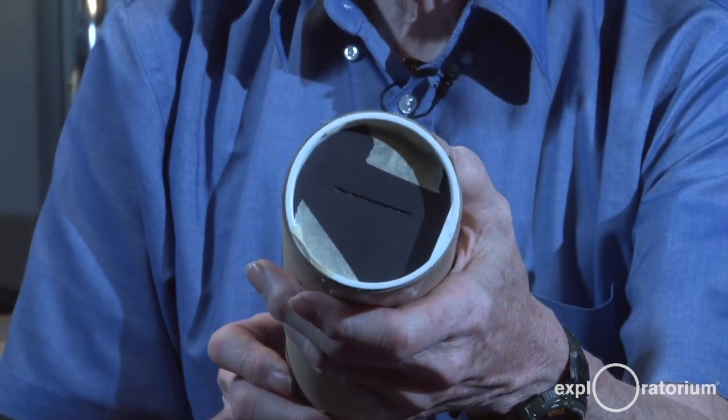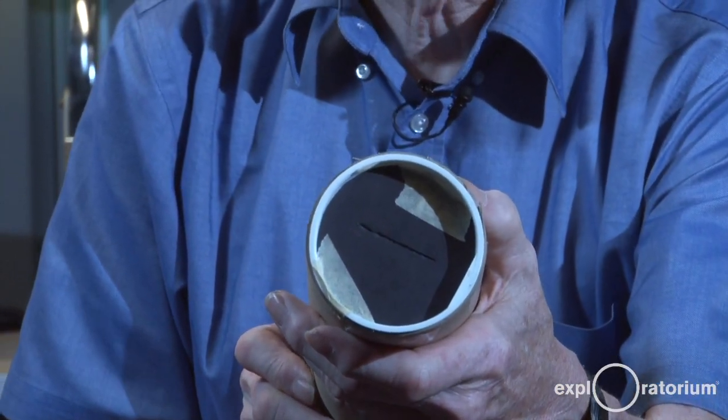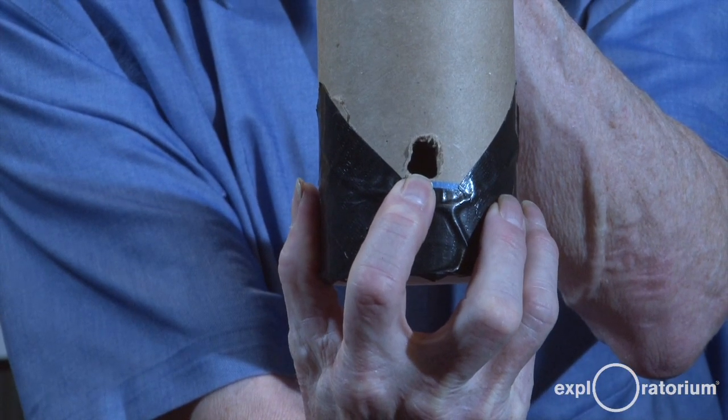It's got a tube which shields from outside interfering light. It's got a slit on the end that allows through just the light that you want to analyze, and it's got a hole for you to look through to see the spectrum.